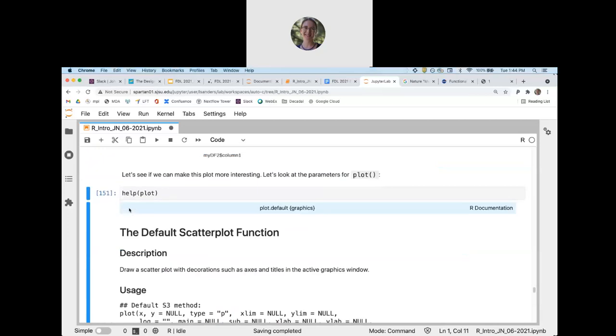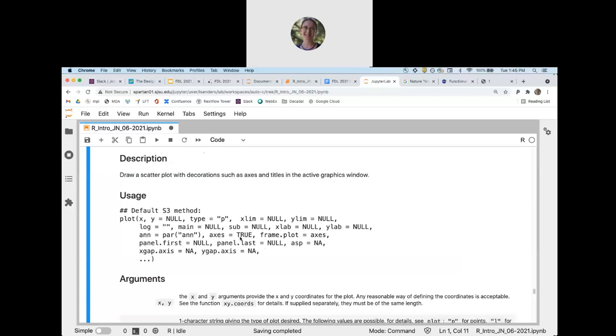That actually doesn't require renaming the column necessarily. And there might be reasons you don't want to rename a column, especially if you have metadata that's associated with your actual genomic data and it relies on having the same names. Maybe the column names are the names of the samples, and then you have another chart that has the names of the samples and how long they were incubated and what the organism type is.